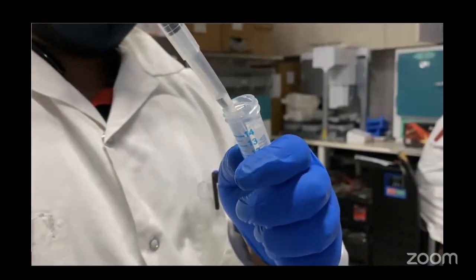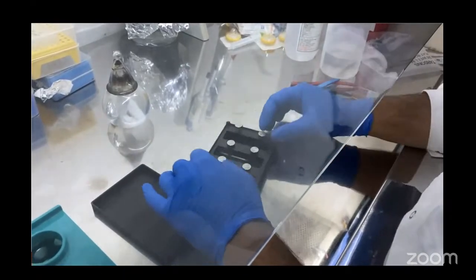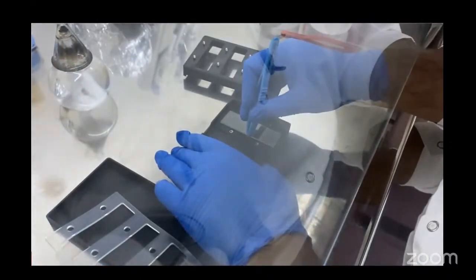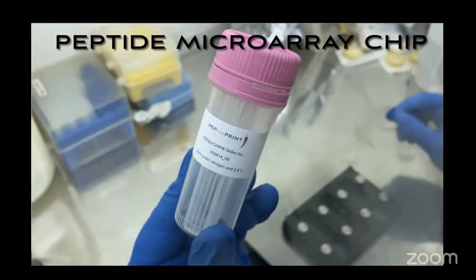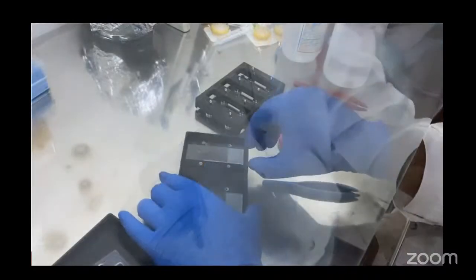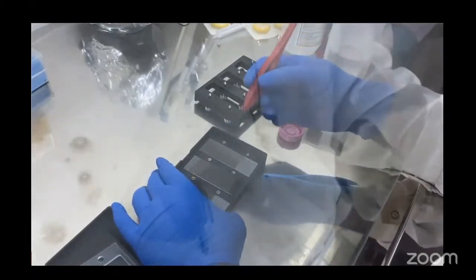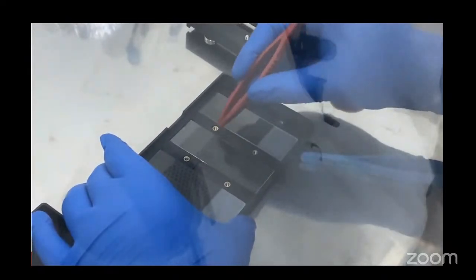After preparing the reagents, we move on to incubation tray assembly. Unscrew the incubation tray by slowly turning the screws diagonally. We will be using two blank glass slides as balancers, since today we will be using only one microarray chip. This is the PepperPrint microarray chip. Slowly take out the chip using plastic forceps and place it on the incubation tray. Align the chip properly onto the tray.